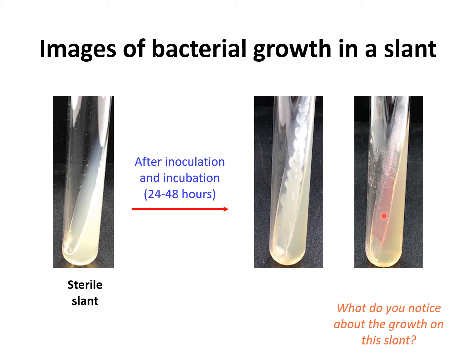It is going to show off the same exact color. It's not like it's only going to show the pink color on a slant but you're not going to see it on the plate. No, you're going to see it in both. Maybe in the broth it's going to be a bit hard, especially if you don't have too much growth, but you're still going to see that pink color throughout the different physical forms of the media that you use.